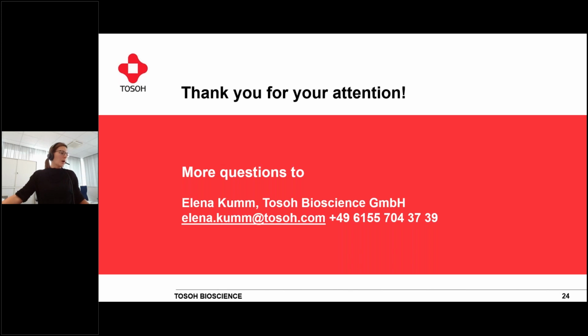Yeah. Somehow we always say that the pore size should be like, I think, 2 to 3 times bigger than your molecule. So make sure your molecule is fitting in the pores, but not everything else. That depends, of course, on what molecules you're looking for. You need a good separation. So important for SEC is, as I said, the pore size, the particle size as well, depending on what you have, the column length as well, and the flow rate.